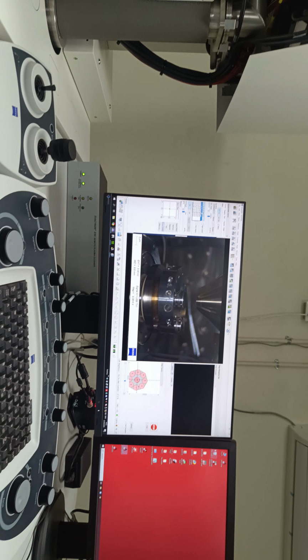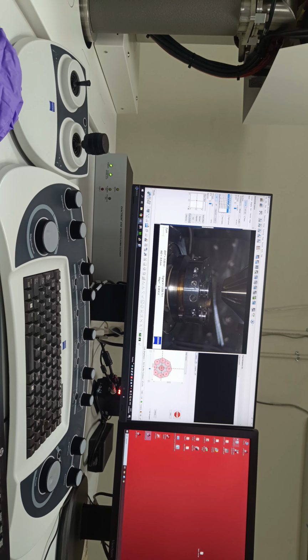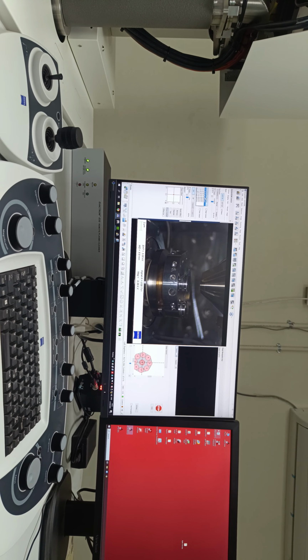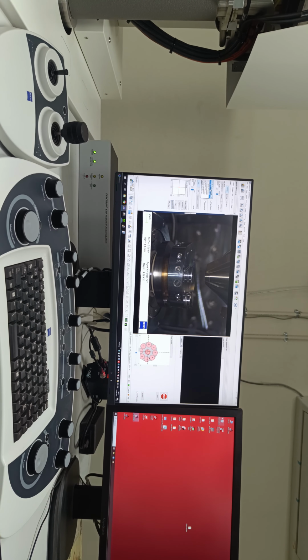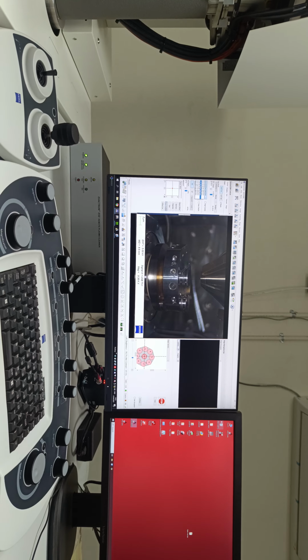Again, to control the probe current, there are 6 apertures available in this particular system. It could vary depending on the manufacturer and also depending on the system that you choose. For a standard application, we generally use the 30 micron.